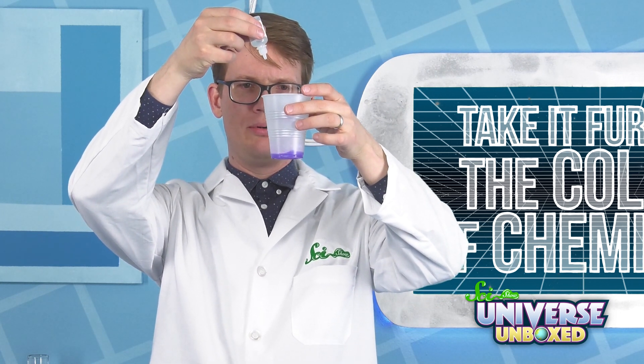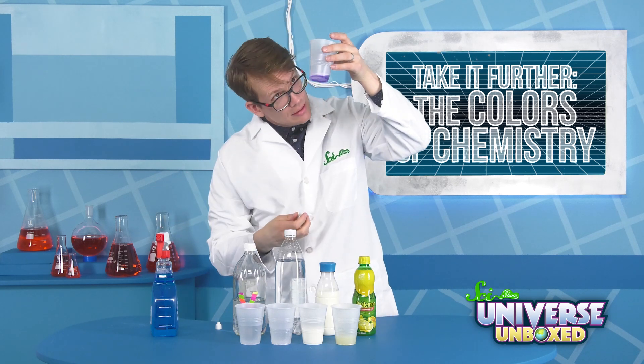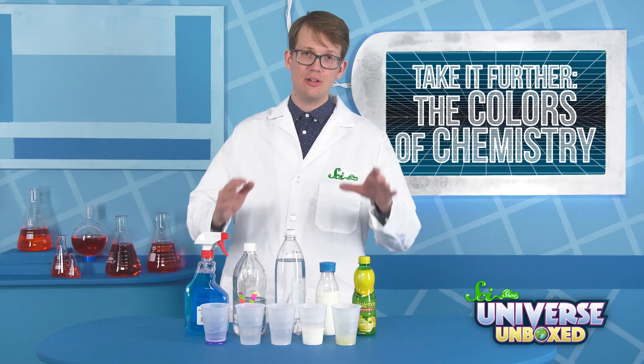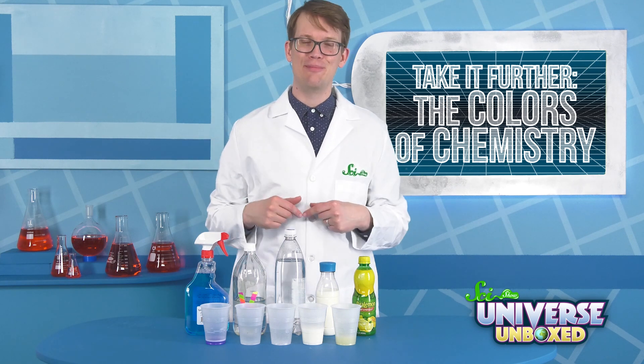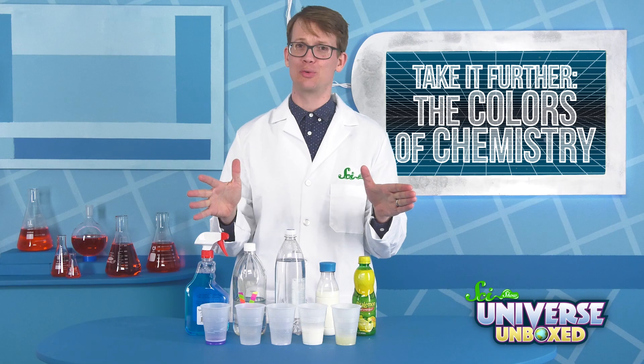That is an immediate purple that we have, because this was blue, and the pink of the phenolphthalein is mixing together to make a really pretty purple. Now, when you're done with this experiment, make sure to empty every cup separately. Do not mix them all together before you pour them down the drain, because you'd never want surprise chemical reactions.